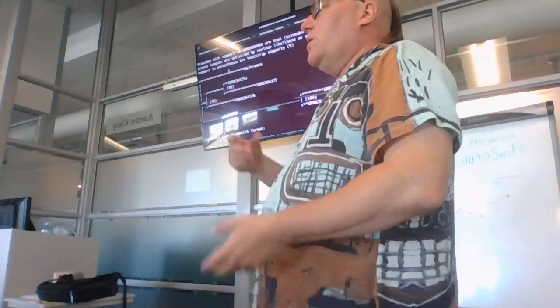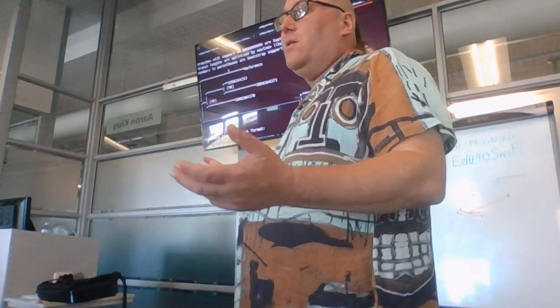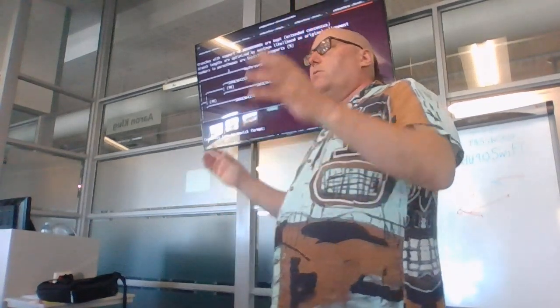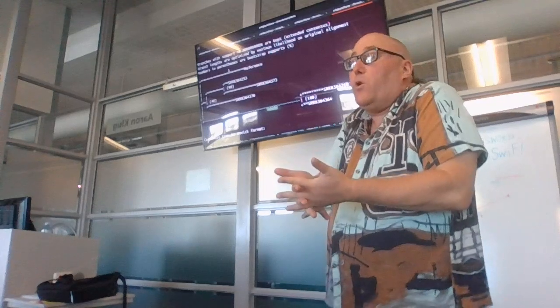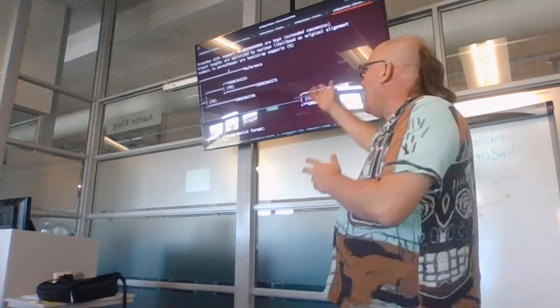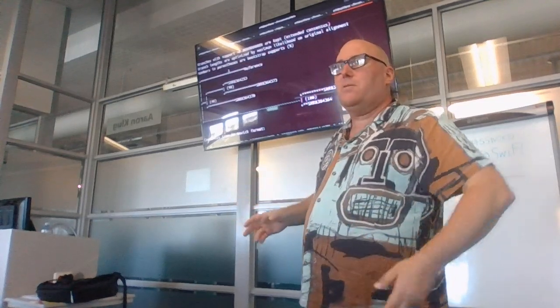Whereas SARS-CoV-2 to another SARS-CoV-2, especially early on in the pandemic, was just 2, 3, 4, 5, 6, 7, 8, 9, 10 differences. So you must choose something that you don't want to collapse, depending on what your question is, right? Here we're investigating an outbreak in Haiti, so you choose appropriate for Haiti, right?